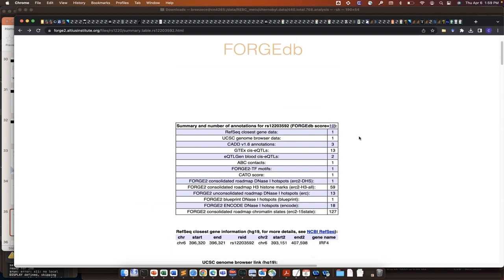Exactly. Yeah, completely agree. So we're trying to provide more functionality in terms of interactive data sets. We provide links to not just the original data, but especially to the EQTL associations, so we can plot those, and also have a plot for the score, which describes your score, like a plot on a paragraph.